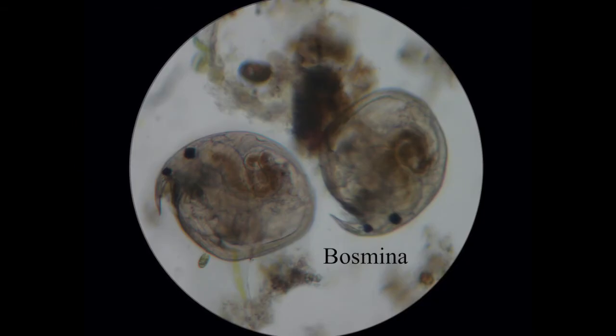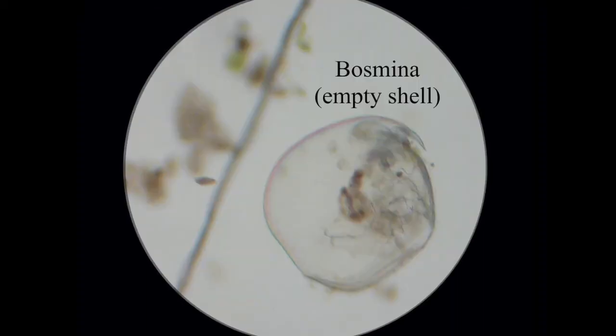This is bosmina — very distinctive because it's got this pointy beak that hooks over the front of it. Again, the eyes are very easy to spot. This other one looks very bosmina-shaped, and what it looks like is the cast skin of a bosmina.